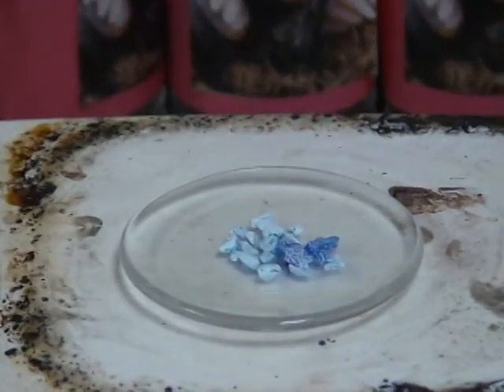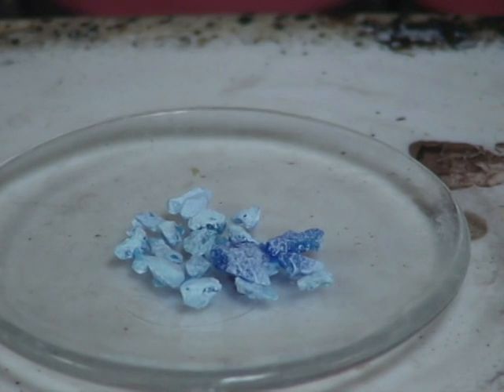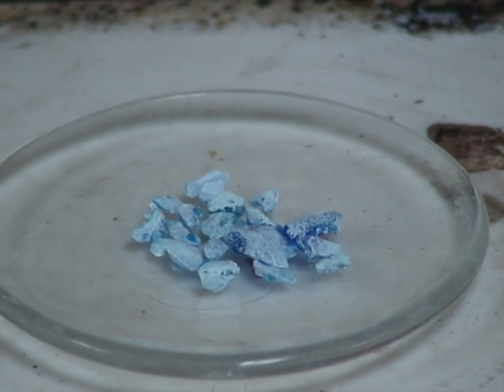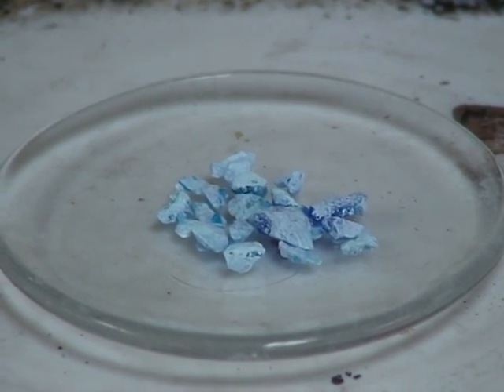Okay, we're going to jump back to our copper sulfate crystals so you can see what's going on over here. They're being heated, and you notice they're turning like a whitish, greenish, bluish color. They've definitely changed color. So we'll let that go a little bit longer, and then we'll see what happens to it.